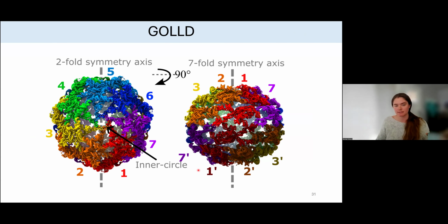This one is much larger and much more complex than that pRNA. Once I was confident enough it wasn't a contaminant, and went ahead and solved the structure, we started to see these beautiful helices. It's clearly an RNA-only structure, and we can again see these nice symmetries.